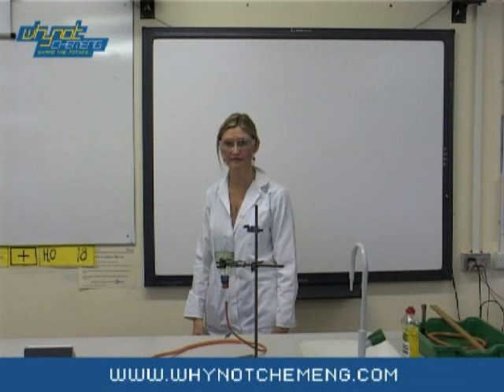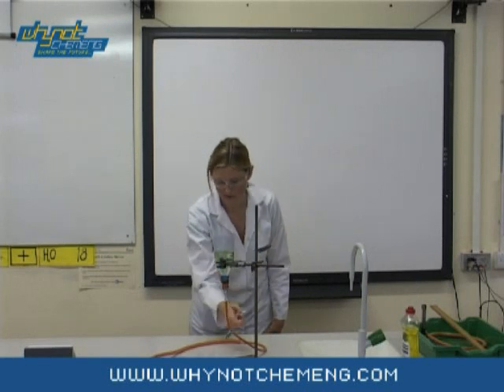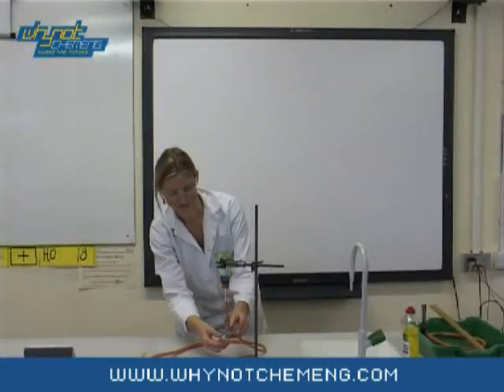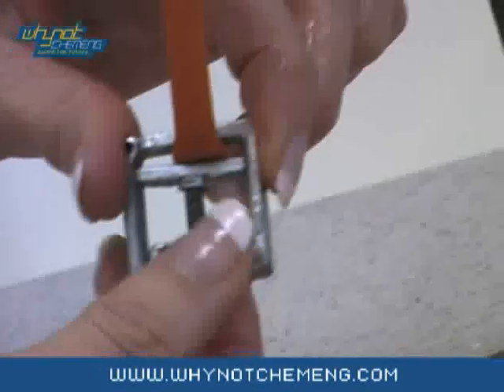The equipment for this demonstration needs to be attached to a clamp stand. The equipment consists of a liter container, a bung, some glass tubing and some rubber tubing attached to the gas tap. You will need to turn the gas tap on and adjust the flow of the gas using the clamp.